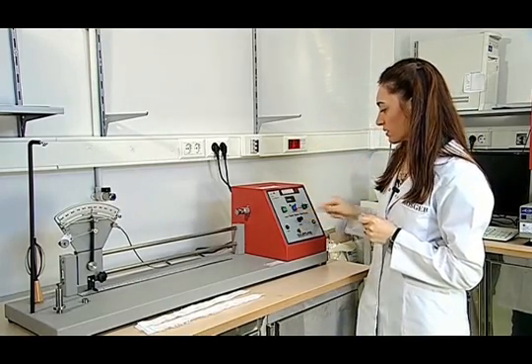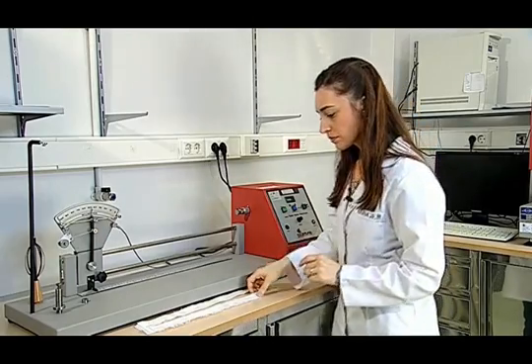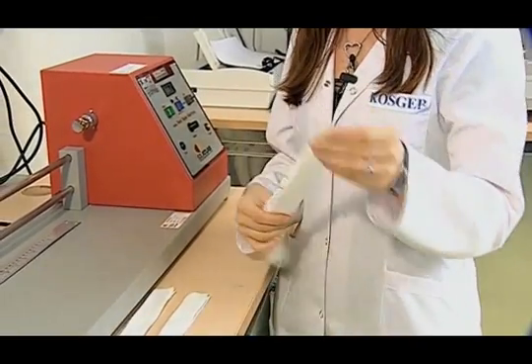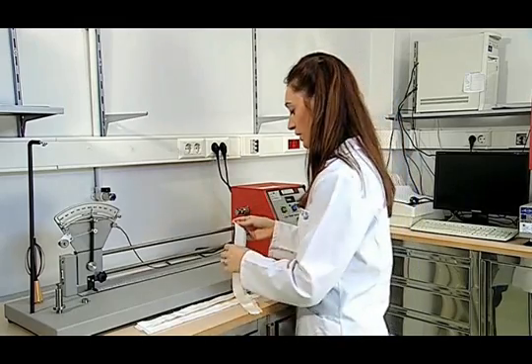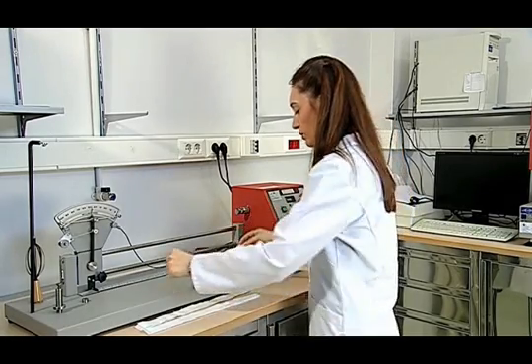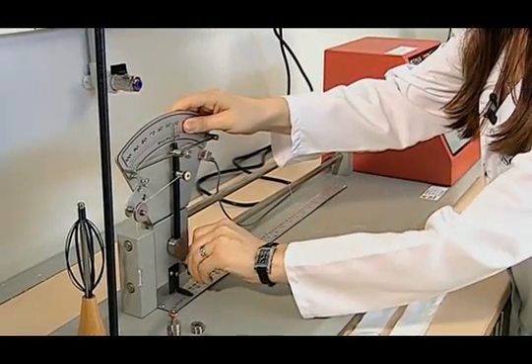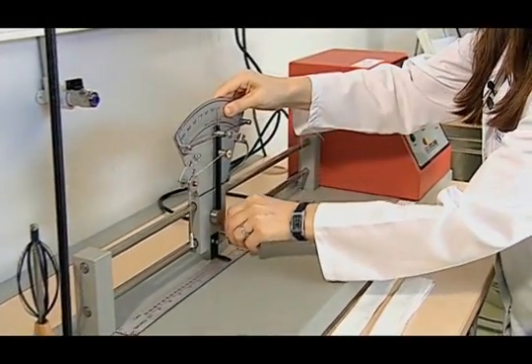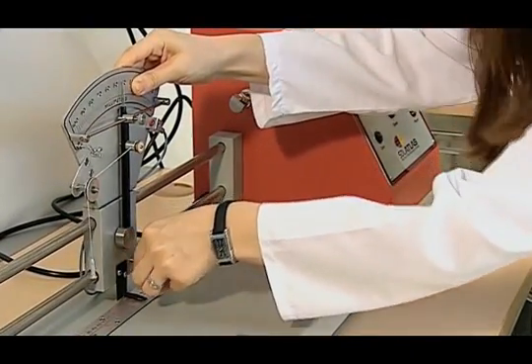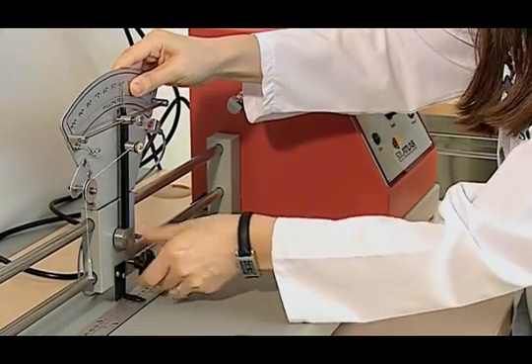Therefore, we set our device to Z twist. Then the test is applied on the sample. In the yarn twist taken out from the fabric, we should not take out the yarn before the test, because an opened twist will fail the test. The test area is prepared in accordance with 20 cm long samples. When it comes to exactly 20 cm, we fasten it.